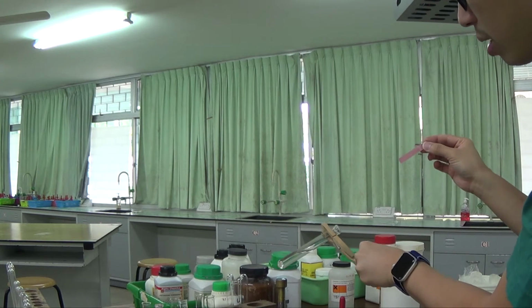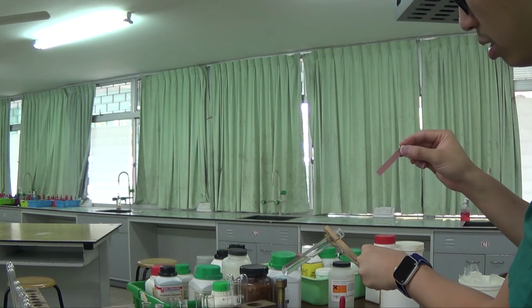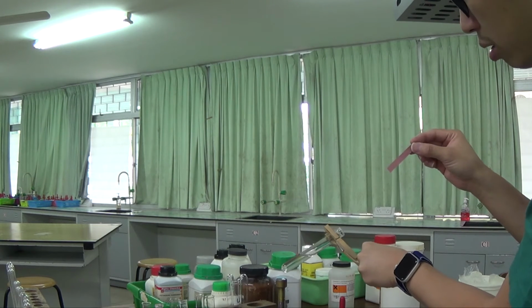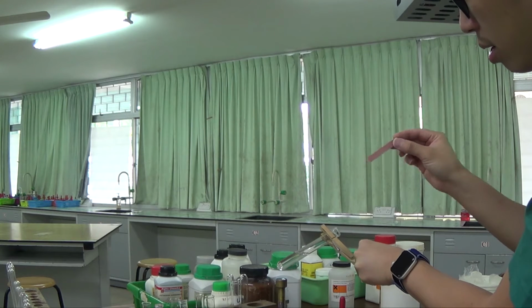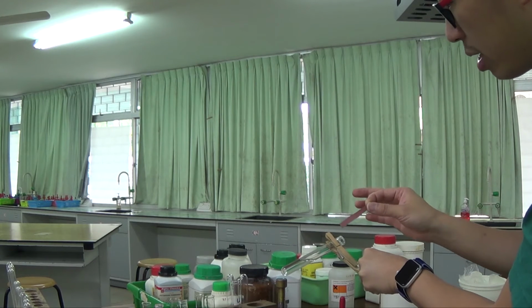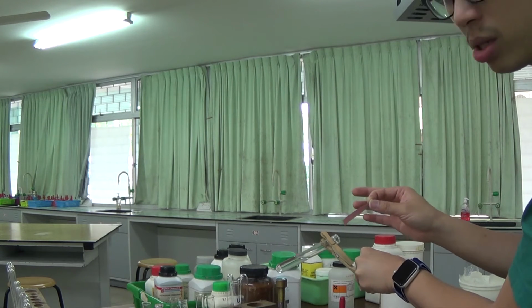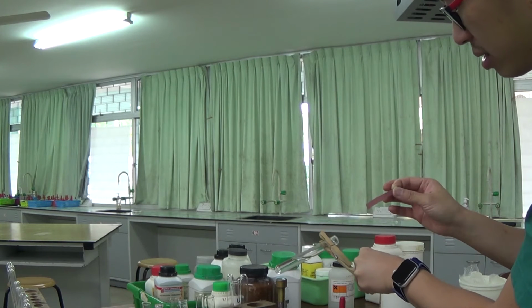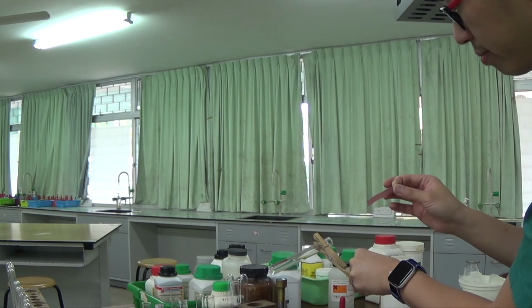So heat it. This is actually quite a lot of solution, so it's a bit dangerous to heat that much, but I will try to be careful. In the presence of sodium hydroxide together with ammonium ions, they will give off ammonia gas. Hopefully, they should.